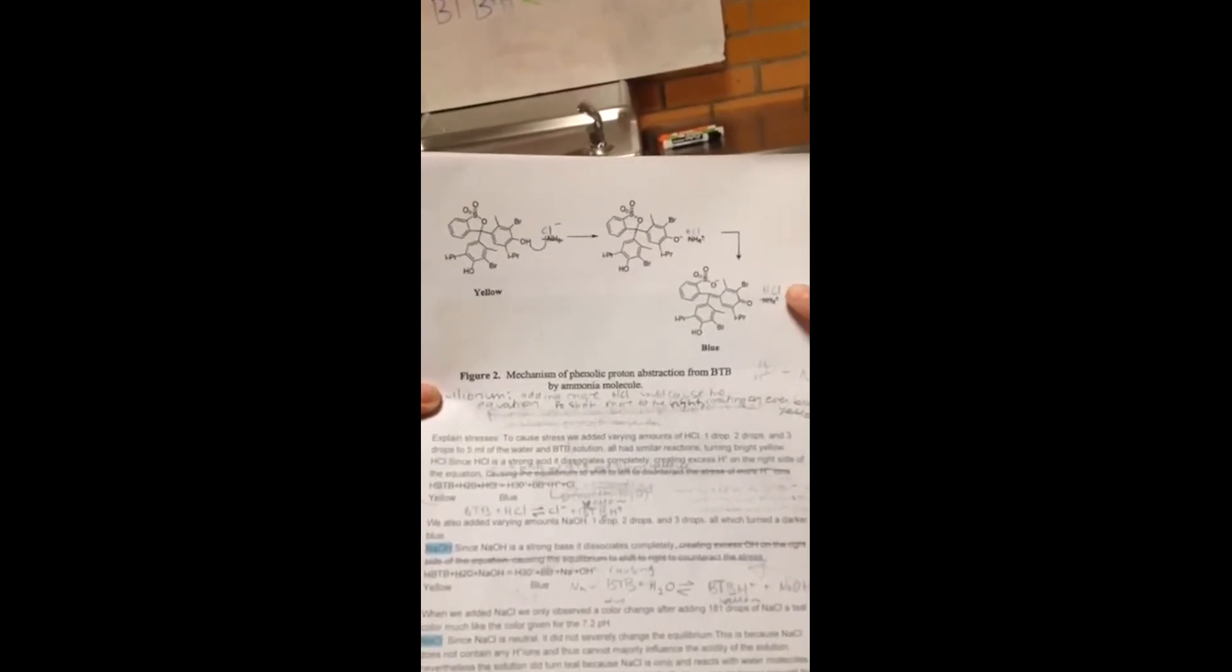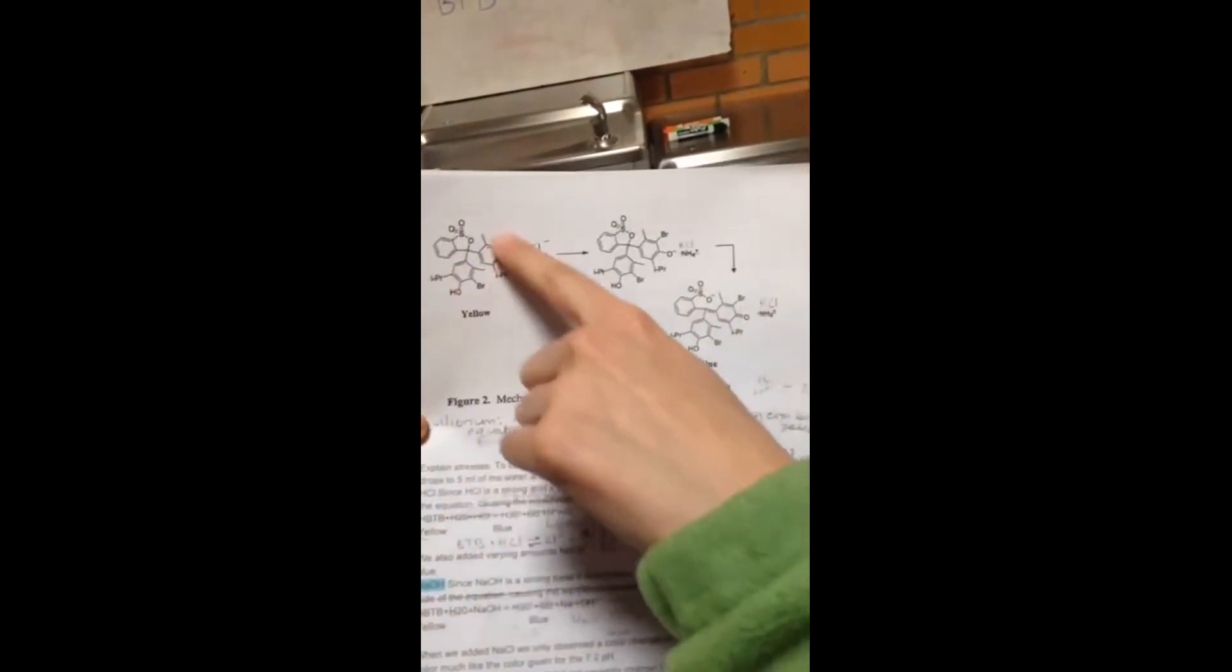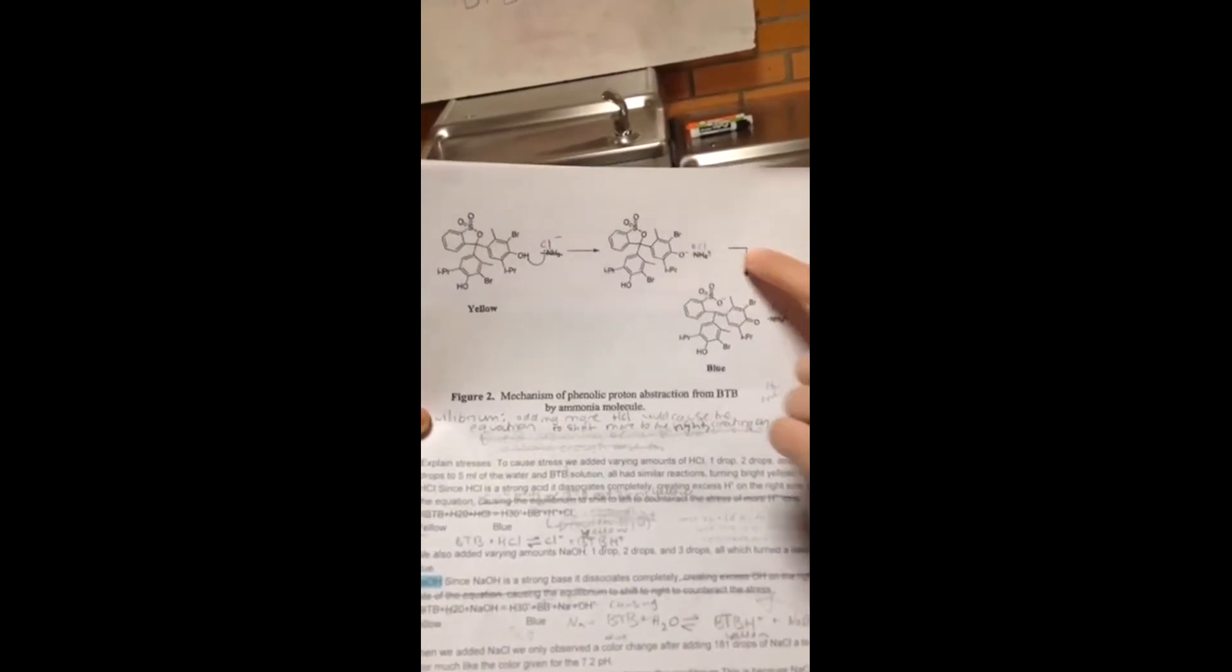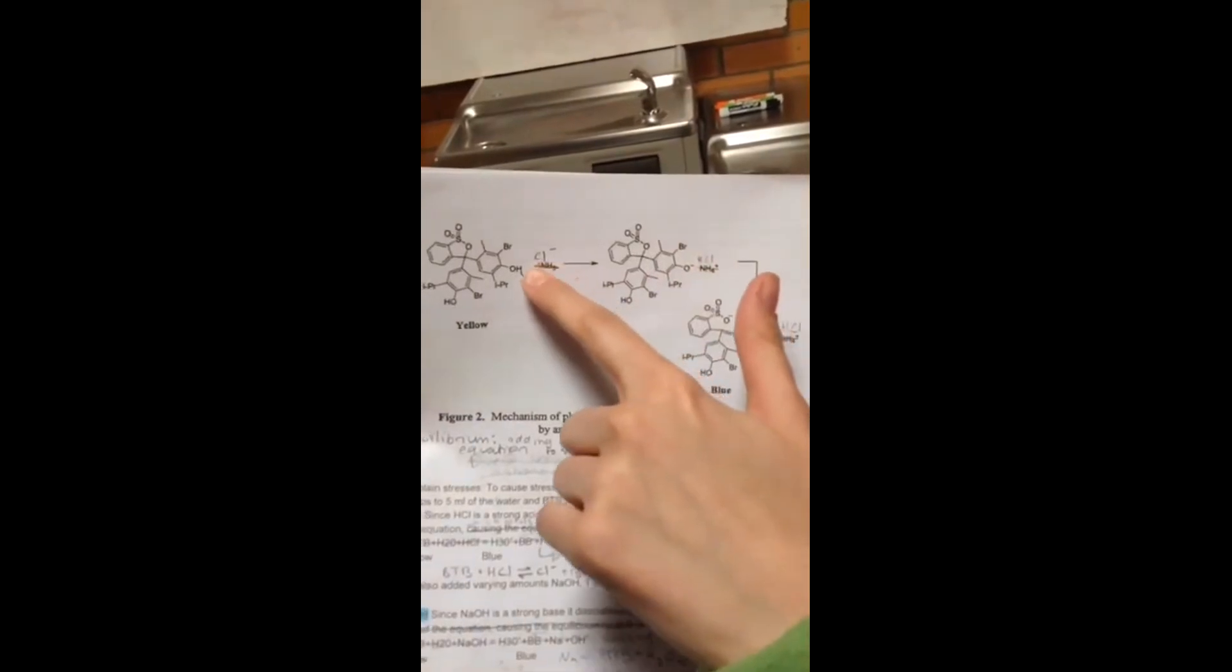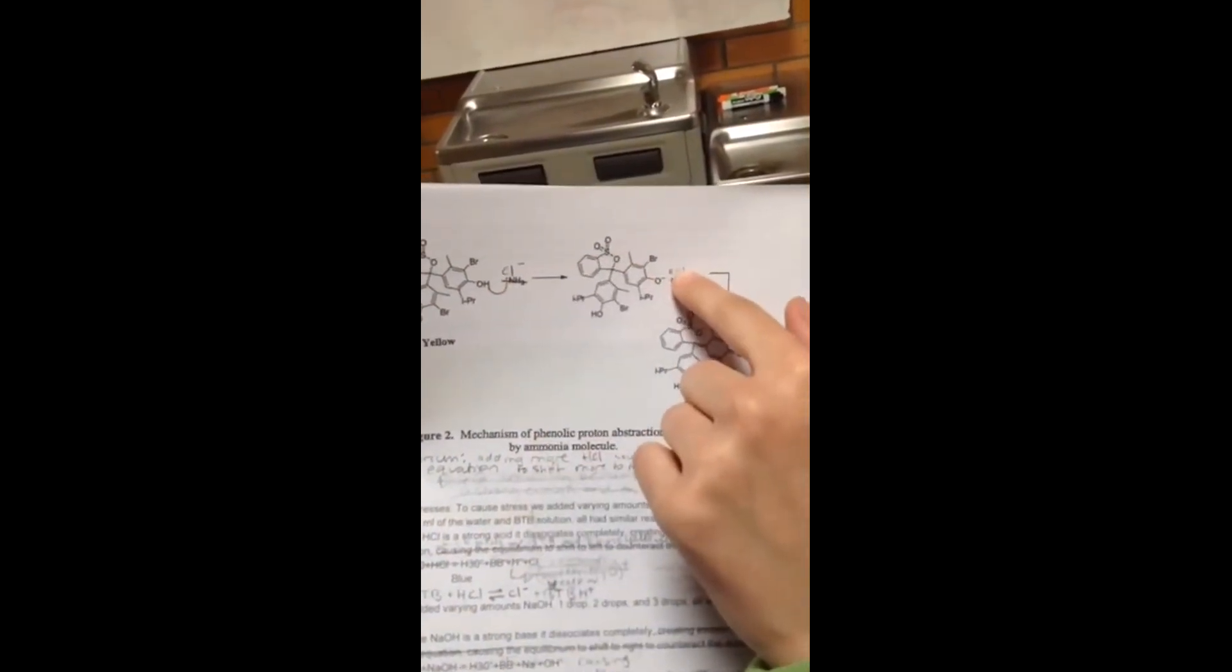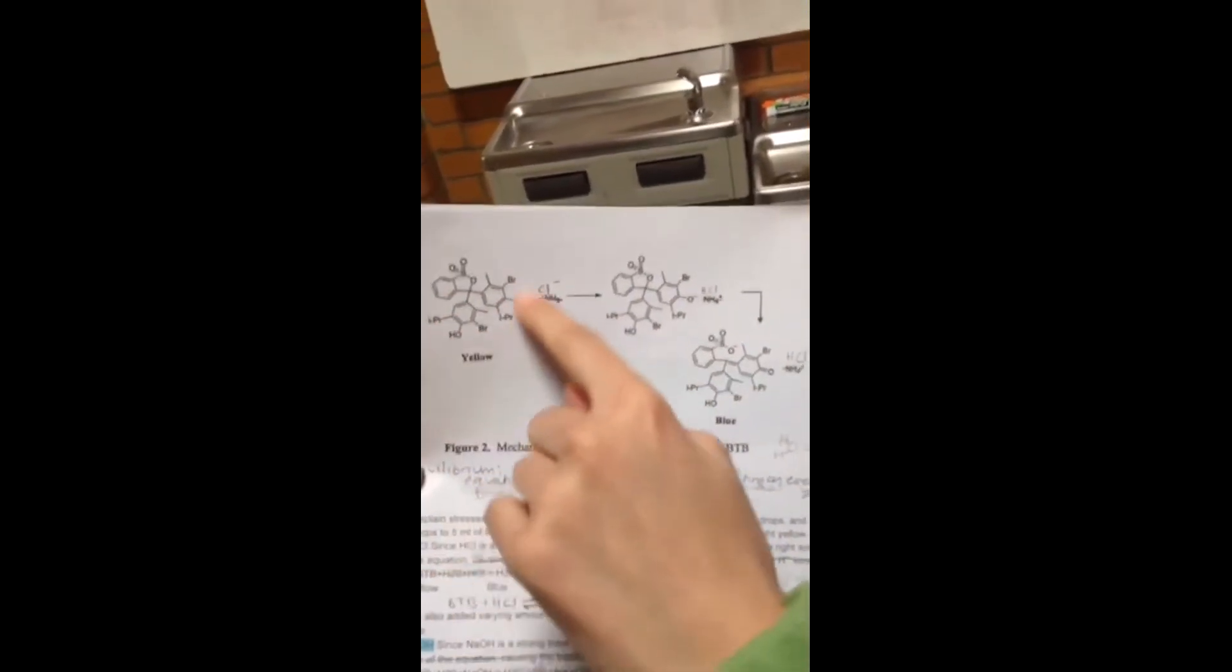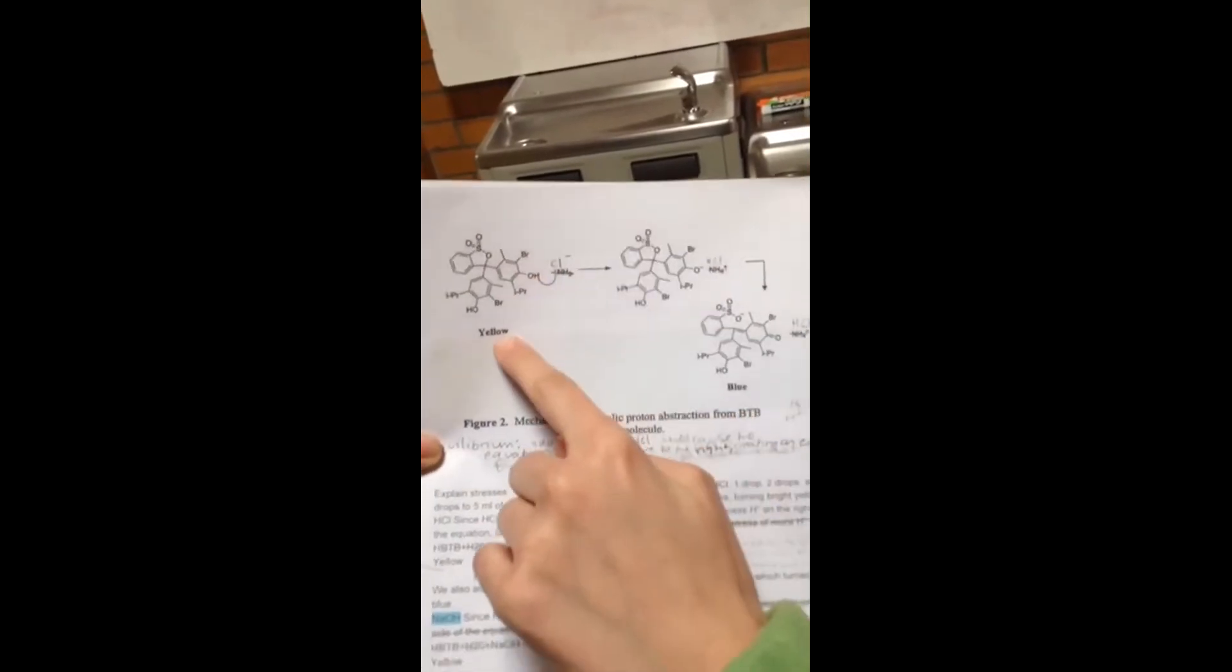When HCl reacts with the bromothymol blue, it first dissociates, the HCl dissociates, and then the H from the HCl combines with the bromothymol blue to turn it yellow.